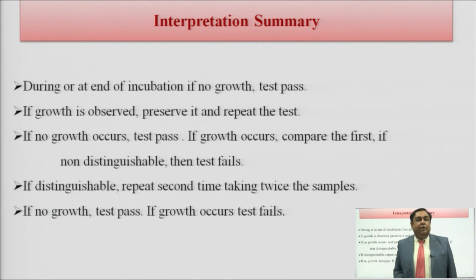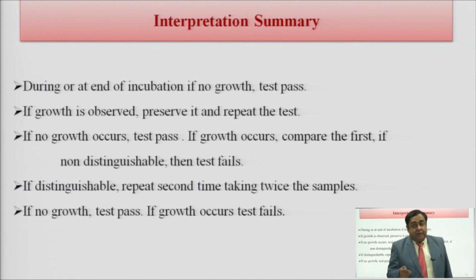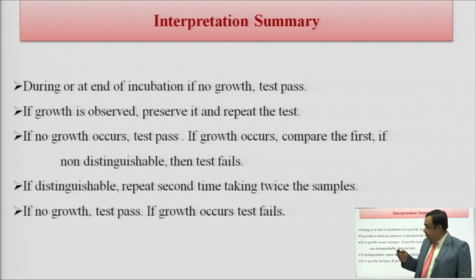So, during or at the end of the incubation, if no growth, the test passes. If growth is observed, preserve it and repeat the test. If no growth occurs, the test passes. If growth occurs, compare it with the previous one. If non-distinguishable, that is, if they are not different, it means there is a microorganism, and the test fails. If it is distinguishable, repeat the second retest with twice the number of samples. If no growth, the test passes. If growth, the test fails.